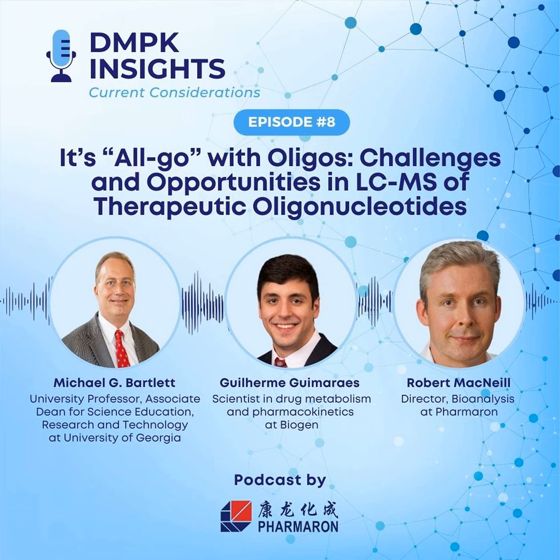Which brings me to the next big question. What does the future hold, do you think, as regards the evolution of high-res mass spectrometry and the other popular alternative, triple quadrupoles? How might selectivity and sensitivity compare?